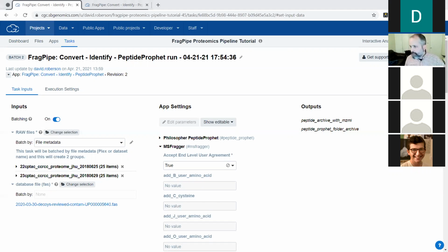This is Kritika again. I have a question for Felipe. Normally in genomics workflows, we run an algorithm that does the quantification first, and then you add the annotation. Even in metabolomics, you do the quantification, and then you try to identify the metabolites. Here in this case, you're identifying it first, and then you're trying to quantify it, right? Is there a reason why you're doing it differently?